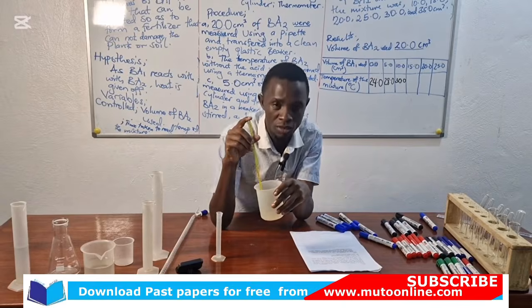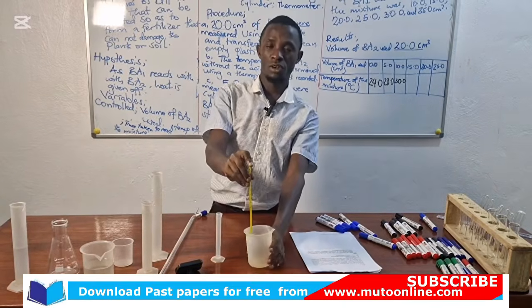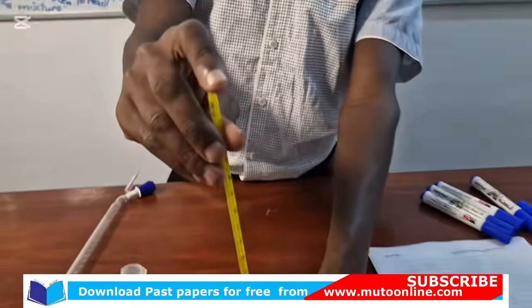So the new temperature reading is stably stopping at 31.